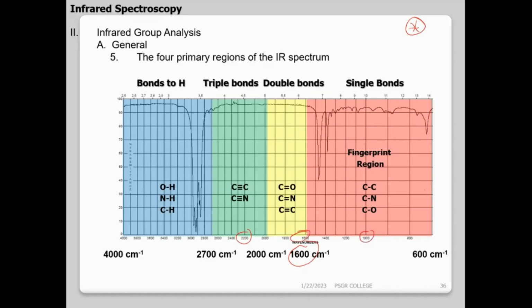நம்ம பார்த்துட்டோம், சரியா? So இங்கல இருந்து இங்க you have from 600 to 1600 you have single bonds. Then you have 1700 range you have double bond. And 2200 range you have triple bond. And here comes again single bond. From 2700 to 4000 again I have single bond.